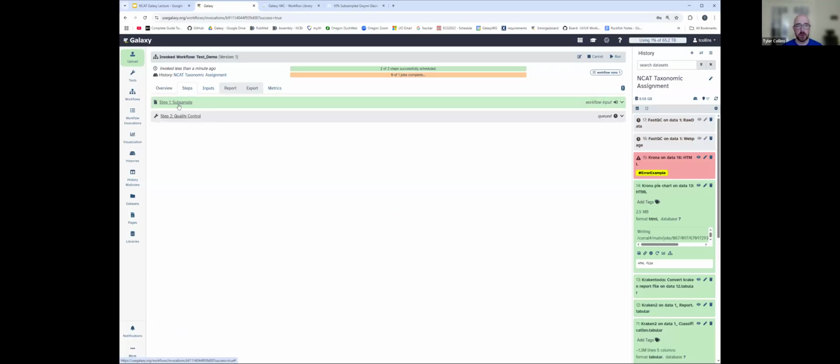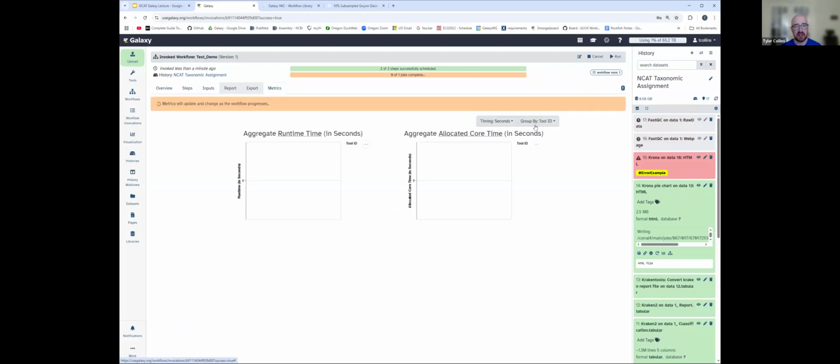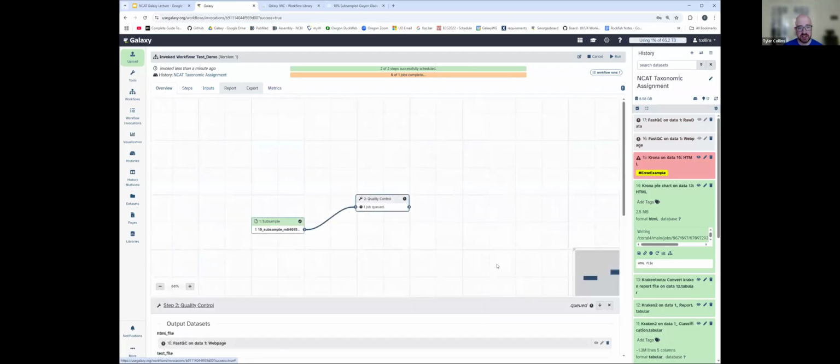Additionally, you can view it through all the steps. In our case, the one we just made is super, super simple. It's 2 steps, not much going on. You can see our inputs are loaded in. And then we'll also get real-time metrics as the job actually starts running for how long it's taking to run, aggregated times. And then we'll show statuses of things that are working.